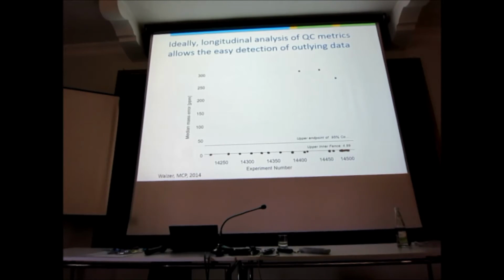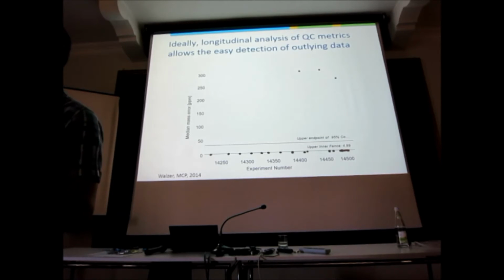So immediately you see something is wrong, right? You want to be able to spot these things longitudinally. You want to assess what is standard performance. What does that look like? And is this standard performance or not? Is it acceptable or not?